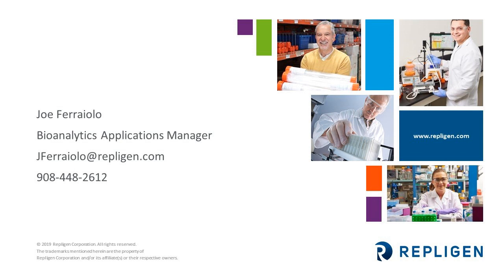I can tell you the biggest leaps forward with using flow VPE. You'll see certain publications coming out within a few months from companies like Janssen, who will be the first to implement the flow VPE within their processes. But I think it's just a matter of now having to revalidate the flow VPE slope-based process over the traditional fixed path-length sensor that resides in the tank. That's probably the biggest area of restraint and where the efforts are needed.